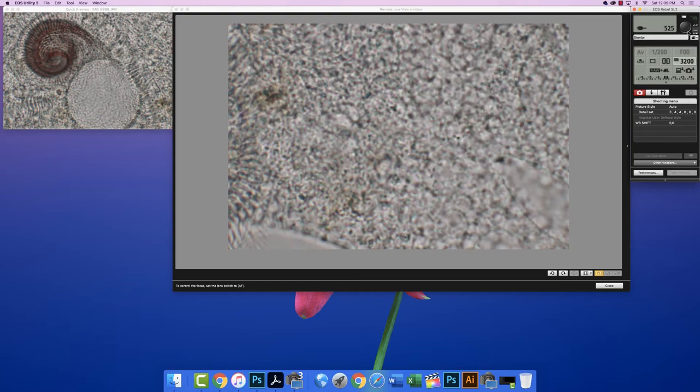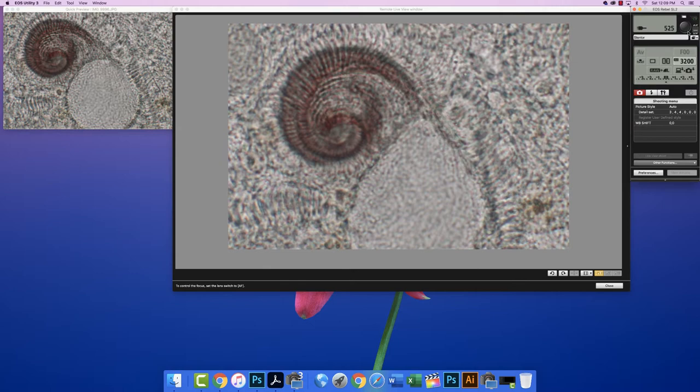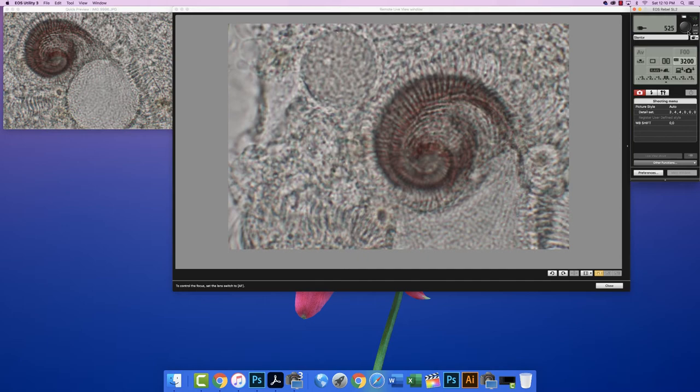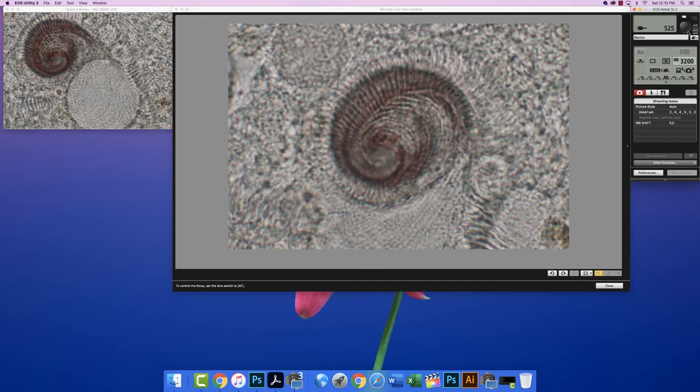So there's a lot to remember. You have to check the white balance every time if you're changing the power on the light source. You have to check your shutter speed as conditions change. You have to try to compose your image, and then you have to pick, in this case, with a high magnification like 100x, you have to focus on what you think should be in focus, what you'd like to have in focus in the image. And even that is a little bit difficult at times.